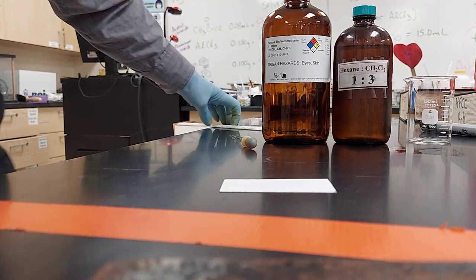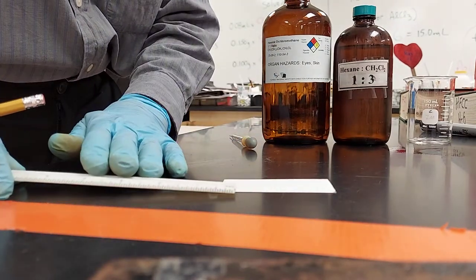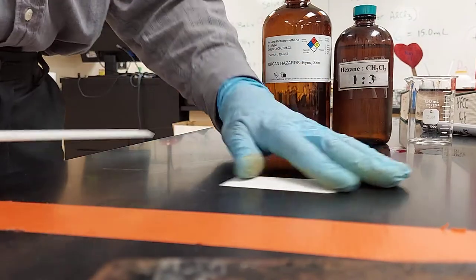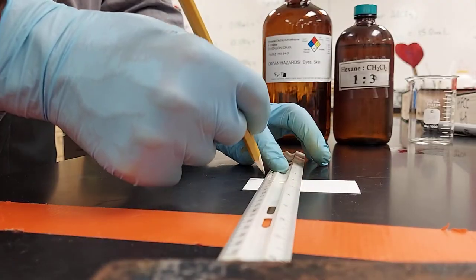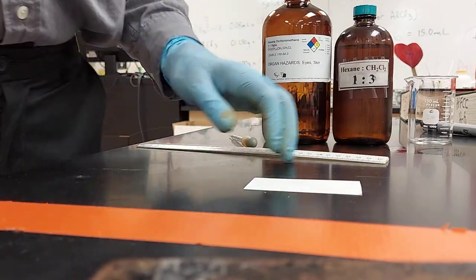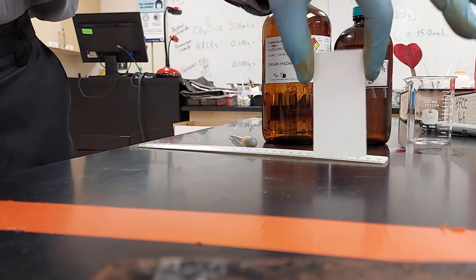We need to set up a line one centimeter from the bottom of a TLC plate. Mark it gently - do not press down. If you press down, you will take off the powder. One centimeter from the bottom.